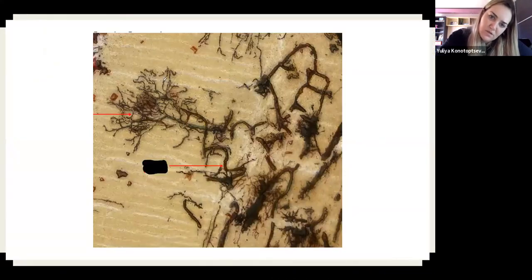So these are going to be the dendrites of the Purkinje cell. Notice how many spines, do you see? It has lots of little tiny, almost hairs that are visible here, right? So the dendrites of the Purkinje cells, and you can see that something is climbing up. Okay, so this is actually a climbing fiber. It's the axon, the climbing fiber that is going to synapse with these dendrites right there.